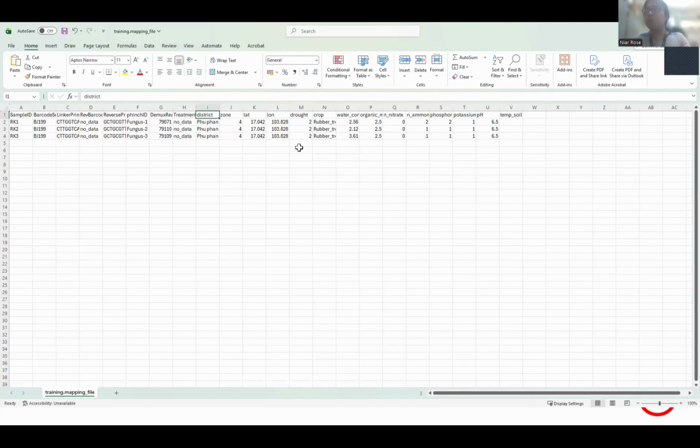If you want to visualize later, you can integrate your data into mapping, for example GIS data, or connect your data to Google Maps, so it's easier to visualize later.